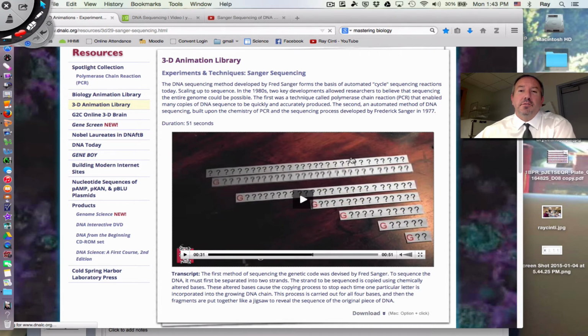template there's a cytosine, because remember we're looking at the complementary. So if there's a cytosine, a guanine is going to be added to that, but then no longer. So replication will take place, but anytime a ddGTP is added, that is when termination occurs. And so you're going to get fragments of different sizes.